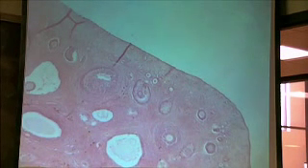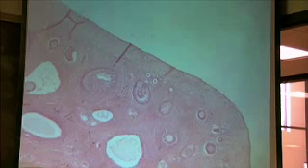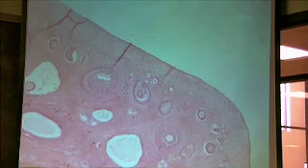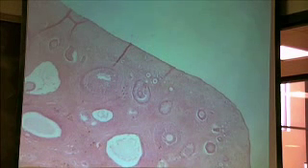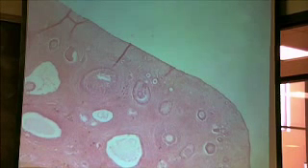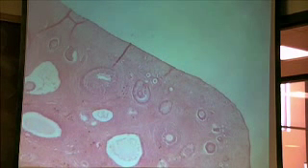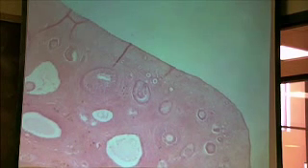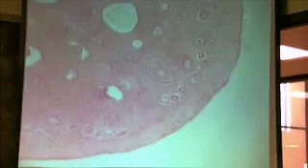So the ovary slide begins on page 89. Now, I'm just going to tell you one thing. You may not find all the structures you're looking for on a particular slide. Okay? Just have that in mind when you pick up one of these slides. Now, this is what it looks like under low power here. And so we're just going to look around this for a second.